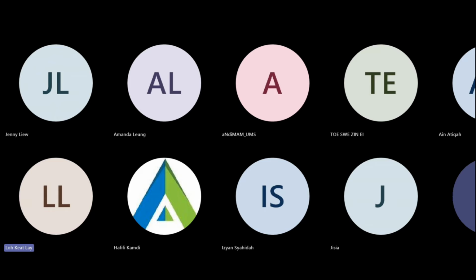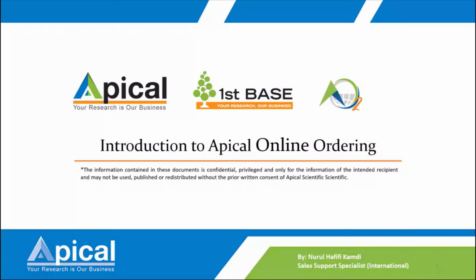For example, you cannot have TTT at the end of the primer, as that will affect your sequencing later on. It may give you some noise.